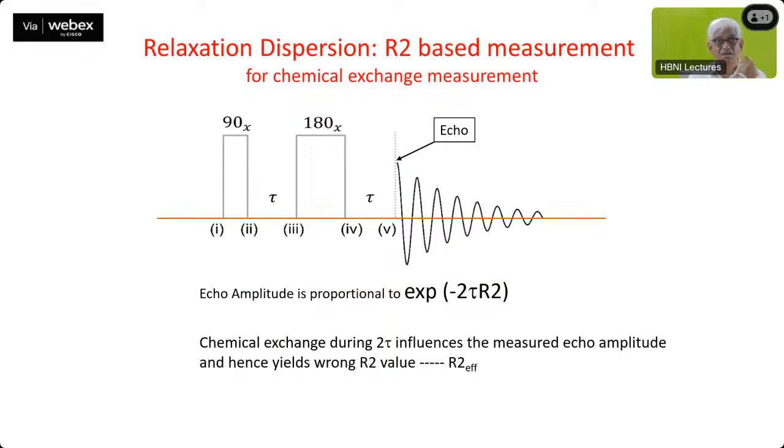We said the dynamics is intrinsic to NMR, and naturally we will extract different motional characteristics from the NMR data. Different kinds of dynamics exist in protein systems at various time scales, from picoseconds onwards up to seconds. These represent different kinds of motions inside the protein chains.